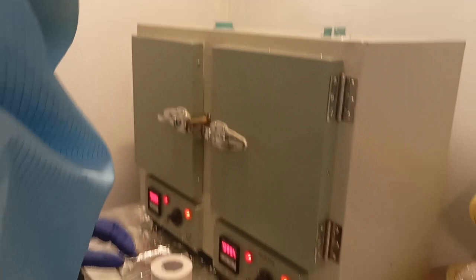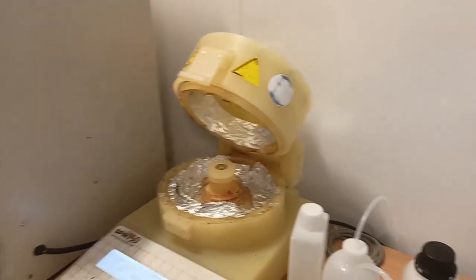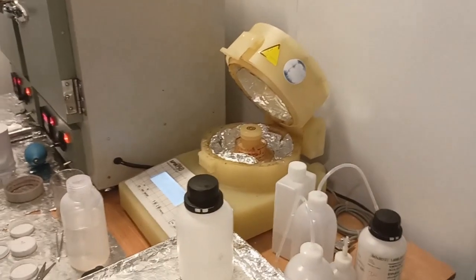Also in the photolithography machine, where the substrate is exposed to UV light, vacuum is used so that because of small vibrations, the substrate and the photomask don't get displaced. If it gets displaced, then the pattern which forms on the substrate will not be useful. Subhajit is cleaning once more with the blower as a precaution, and then he is going to put it in the spin coater to coat it with the photoresist.